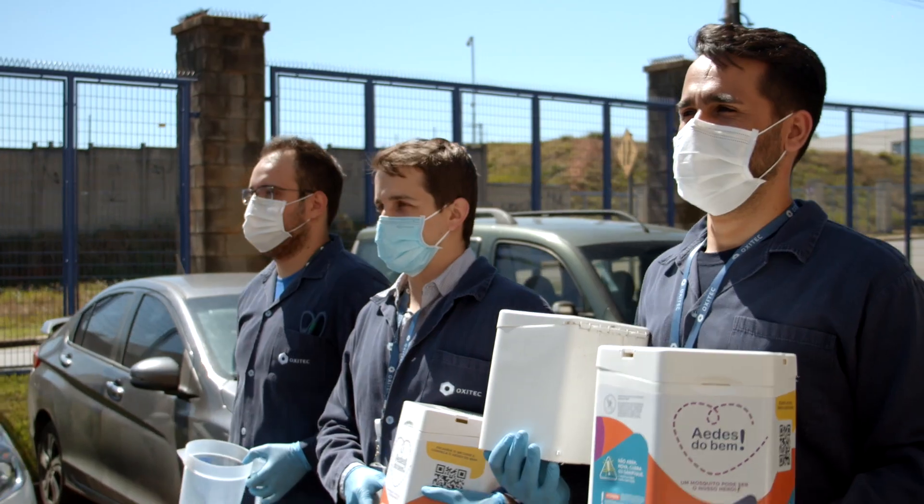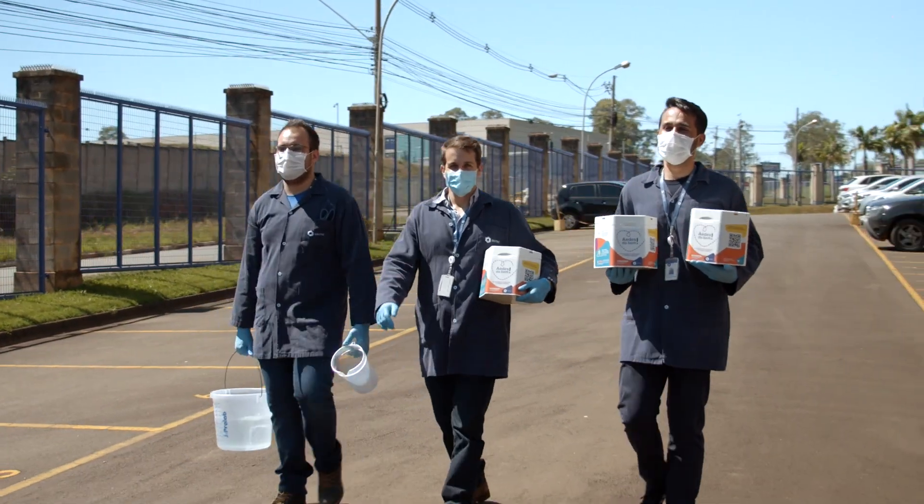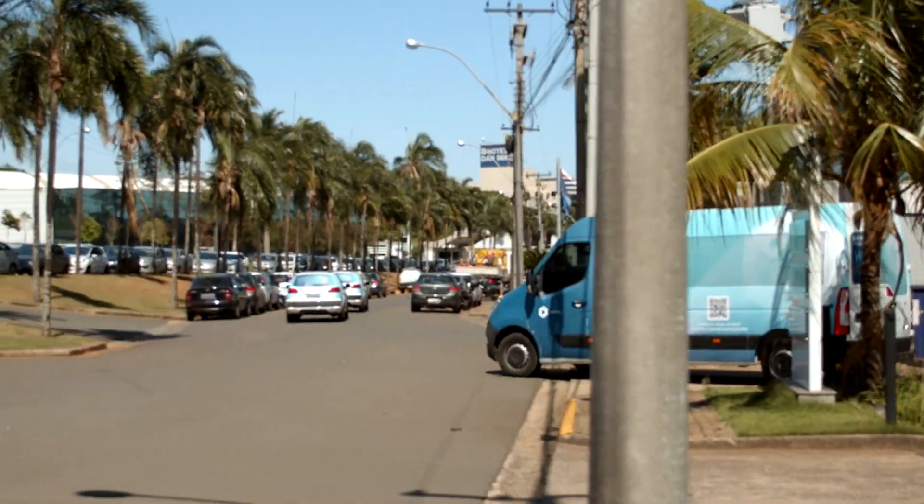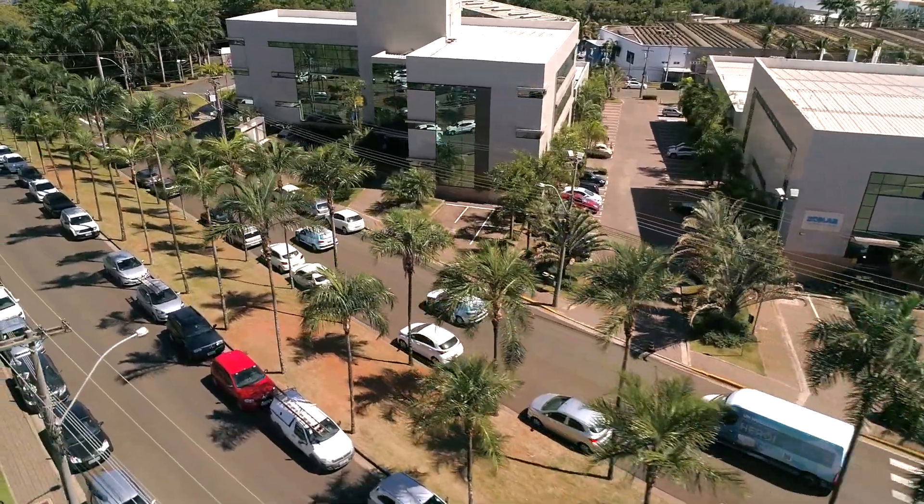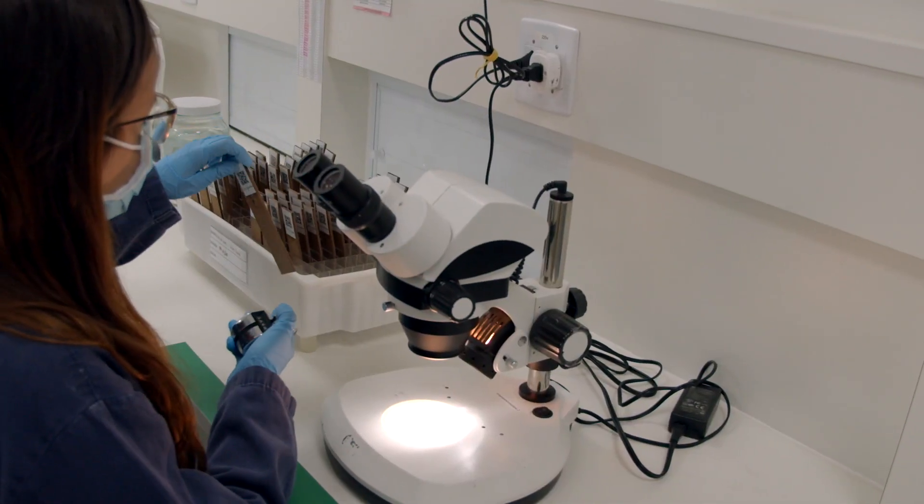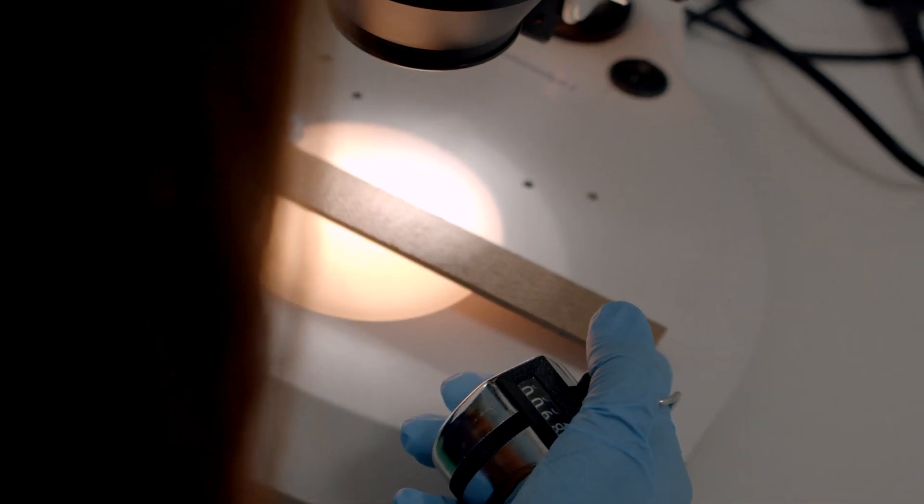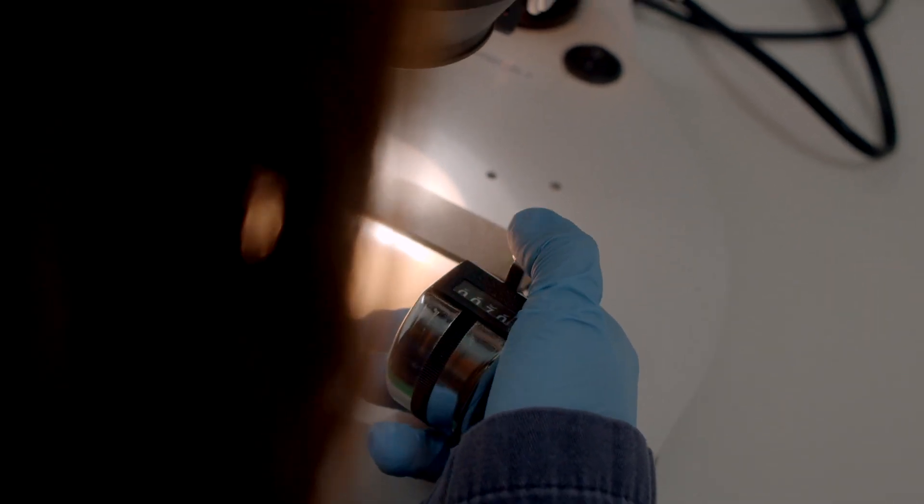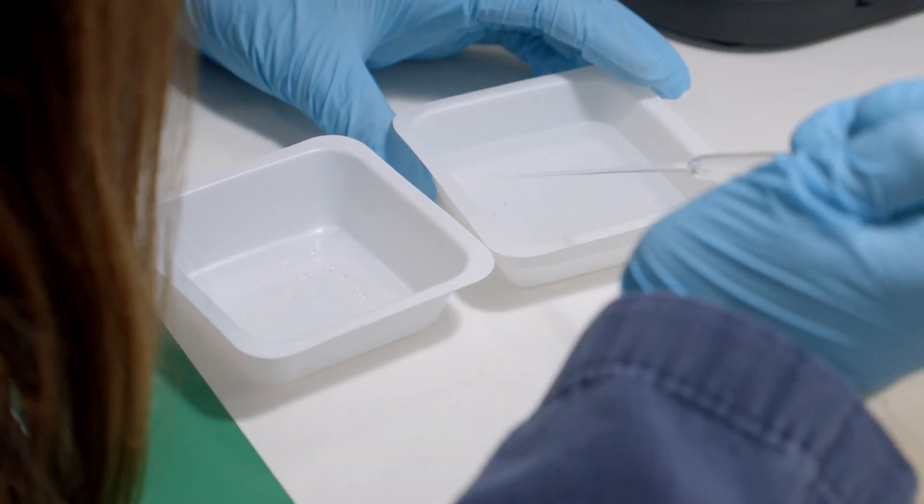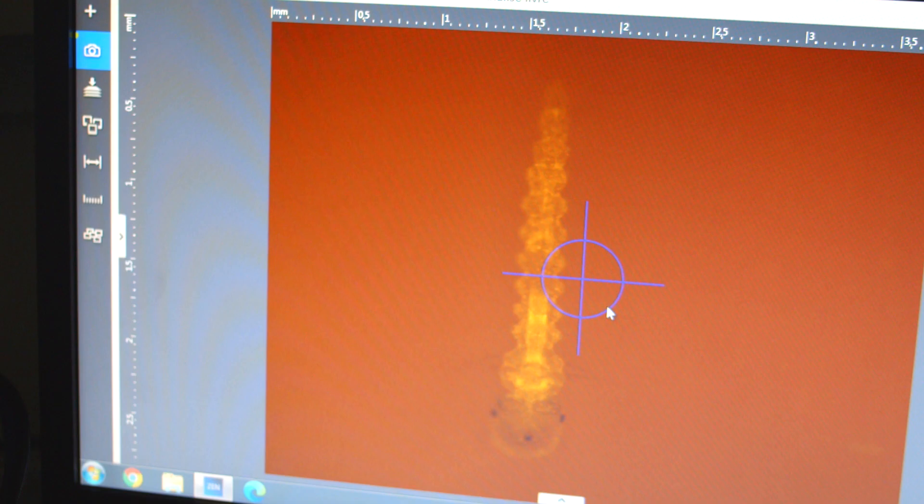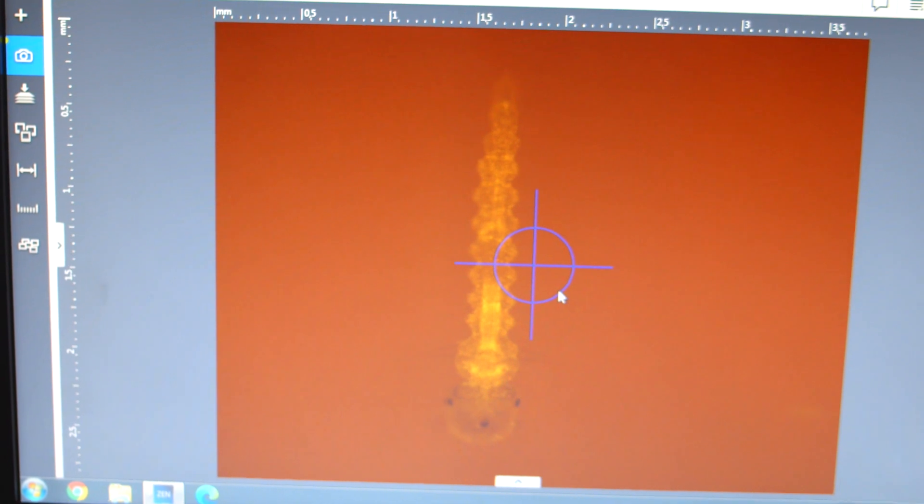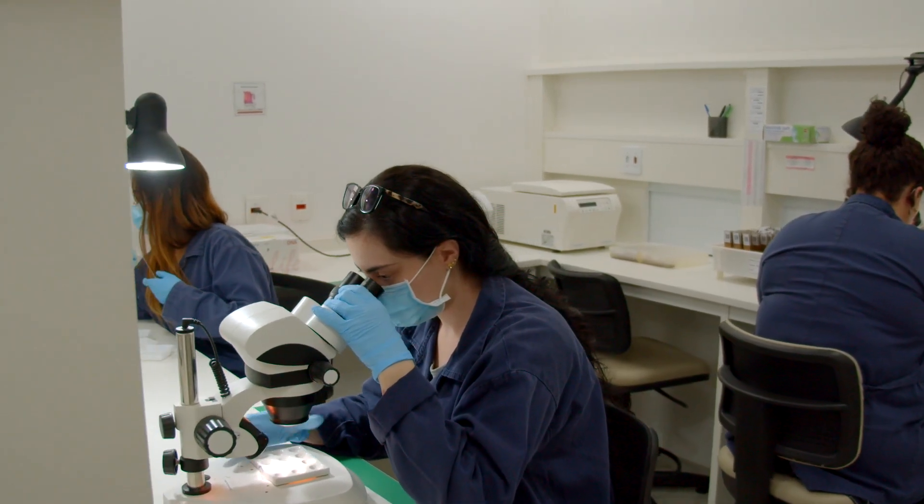Our field deployment team leads public engagement, installs traps and boxes in the municipalities, and collects samples on a weekly basis to be analyzed in the field monitoring lab to make sure we are providing excellent control of the invasive mosquitoes. The lab is set up to process all collections from the field, eggs and adults. Both parts of the facility are separated to make sure no wild mosquitoes collected from the field can get into the production colony. The data is generated and sent to the UK office for reporting, and then full reports are produced in a team effort with Brazil and UK experts for submission to regulatory agencies for approvals.